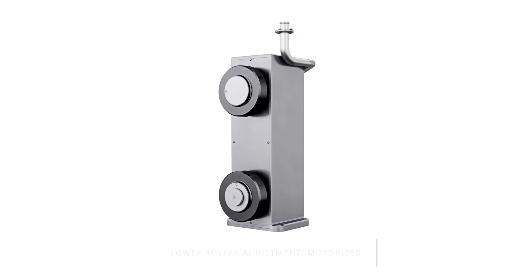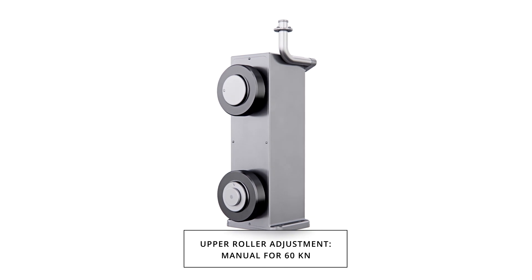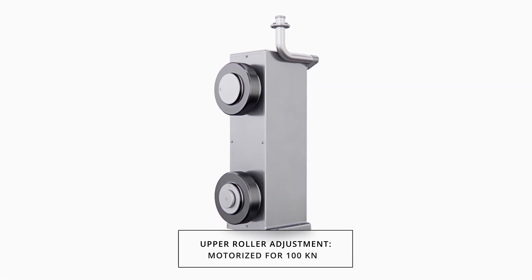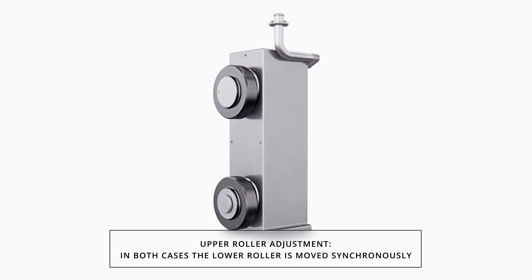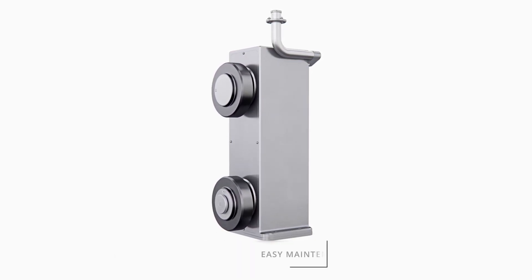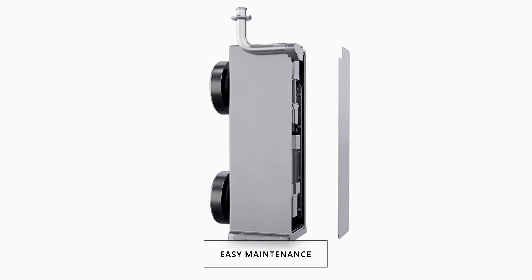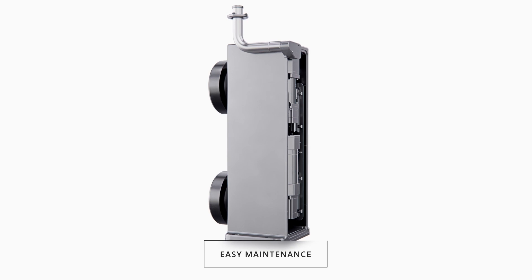the lower rollers are adjusted by precision servo motors. The upper roller adjustment is manual for the 60 kN column and motorized for the 100 kN column. The compression columns are easily serviceable as all components may be accessed through a large access panel on the back of the column.